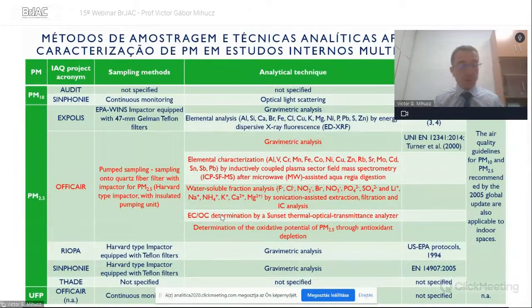so it's not infinite. It means that from the point of view of organic contaminants, we focused on organic carbon, and in parallel, because it's always interesting, the elemental carbon. You know, the difference is that in the case of organic carbon, the PM sample is combusted in the presence of helium, while in the case of elemental carbon, also in the presence of oxygen. So this is how discrimination can be made. Then this carbon dioxide is converted into methane, and it's determined by flame ionization detector.